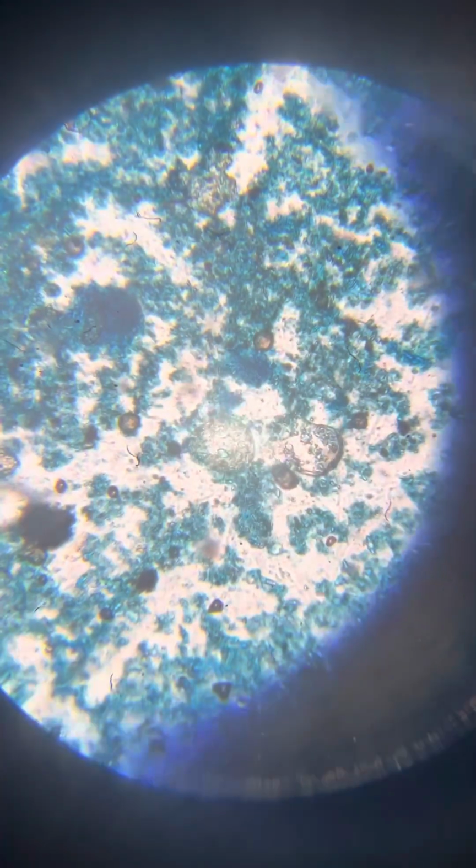Here we see a bigger, quite big life form and small neos. Very nice, very nice. This is the deep sea meta.